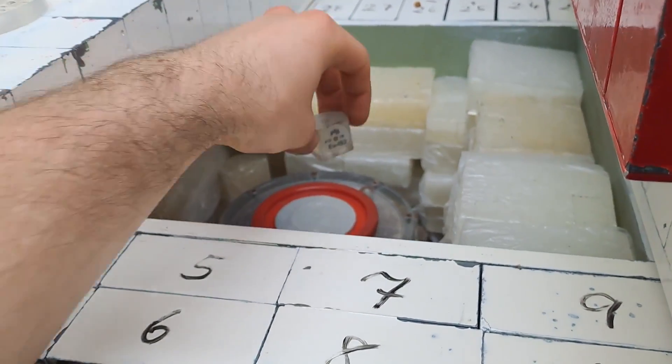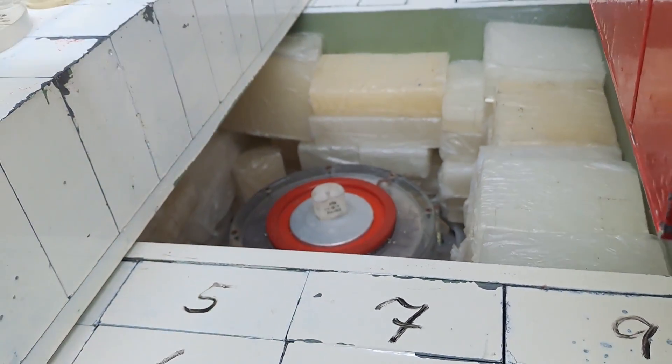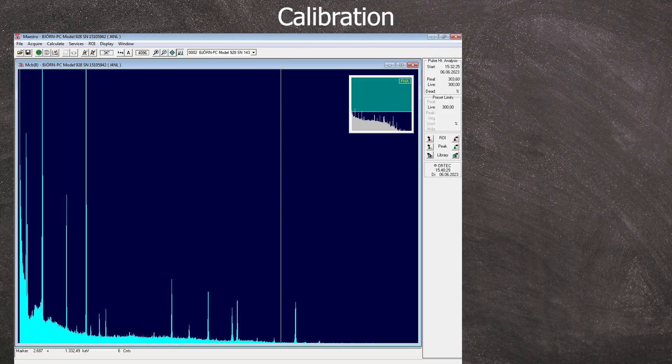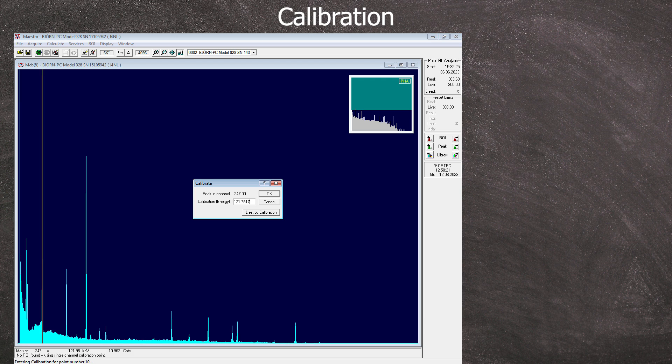Lastly, we measure Europium-152. And there's a lot of work to be done. Europium's variety of peaks from low to high energy makes it a great calibration source. We take the eight peaks with the highest occurrence probability: 121, 244, 344, 778, 964, 1085, 1112, and 1408 keV.